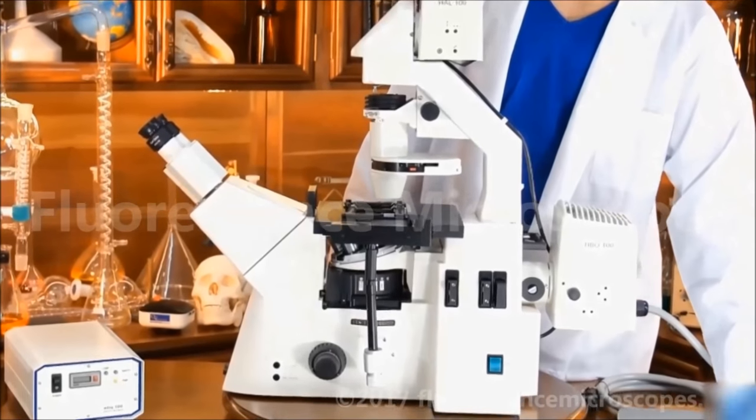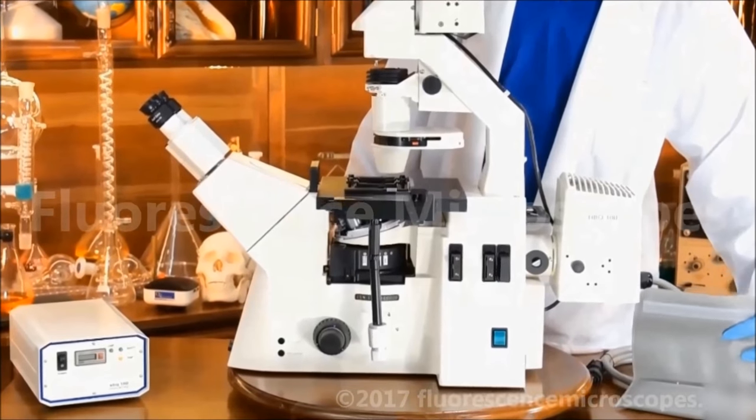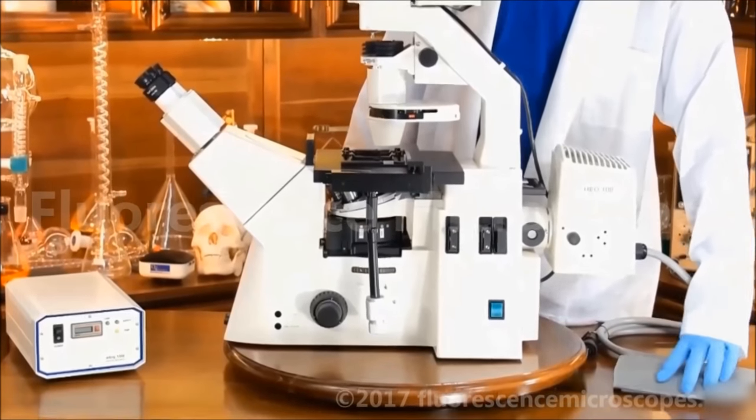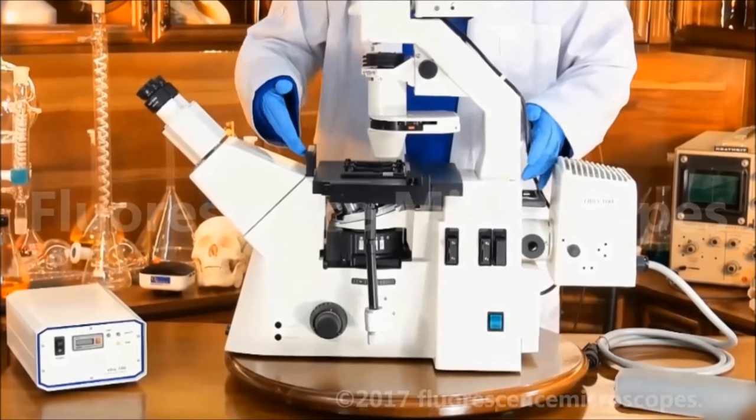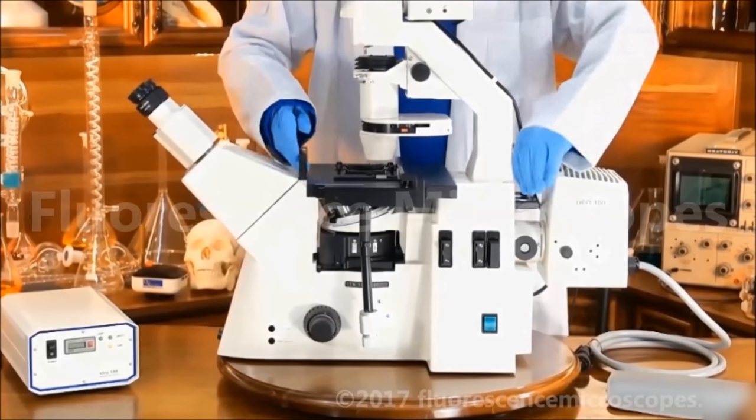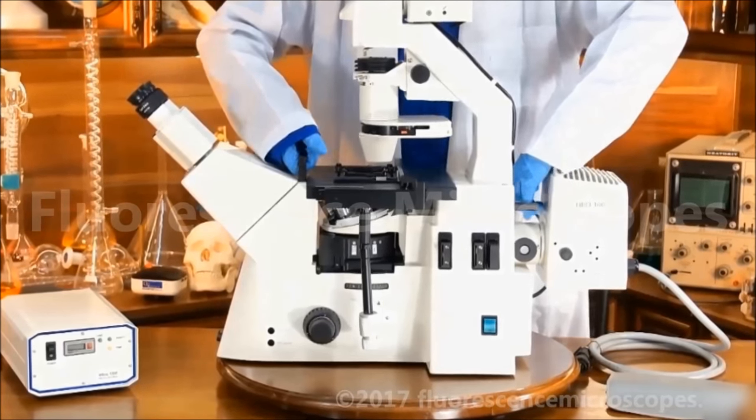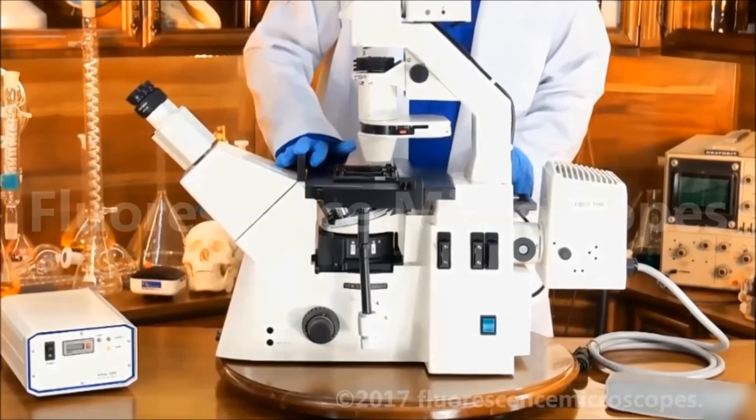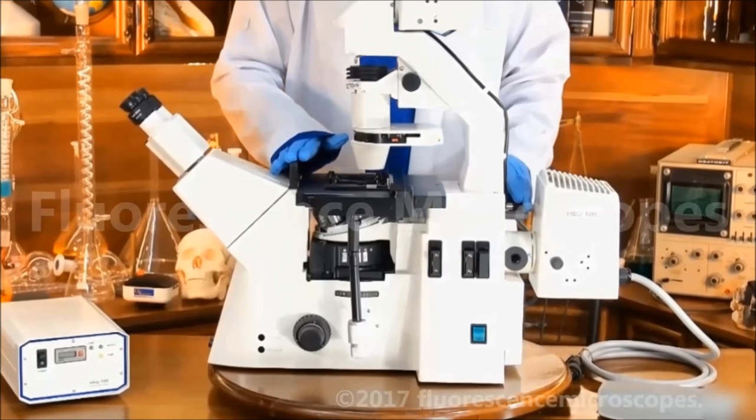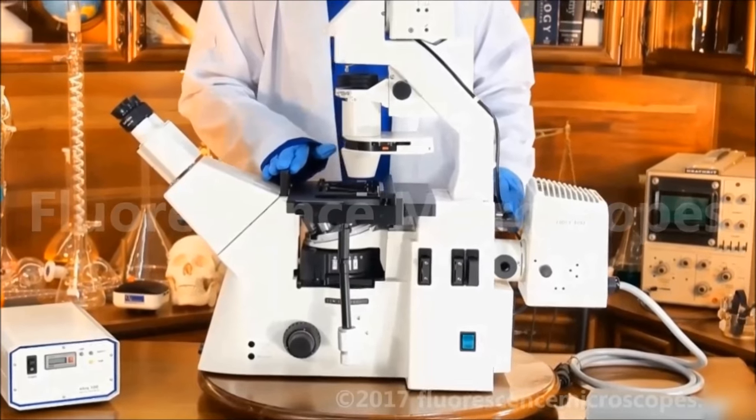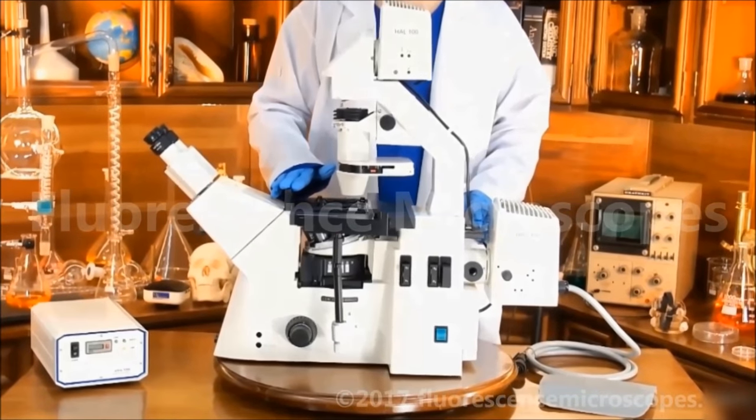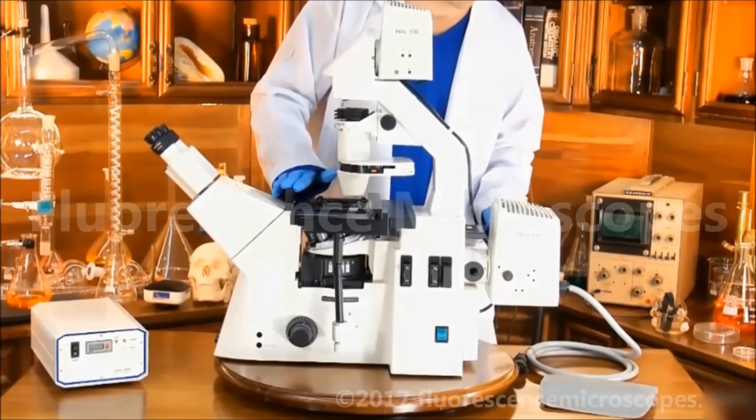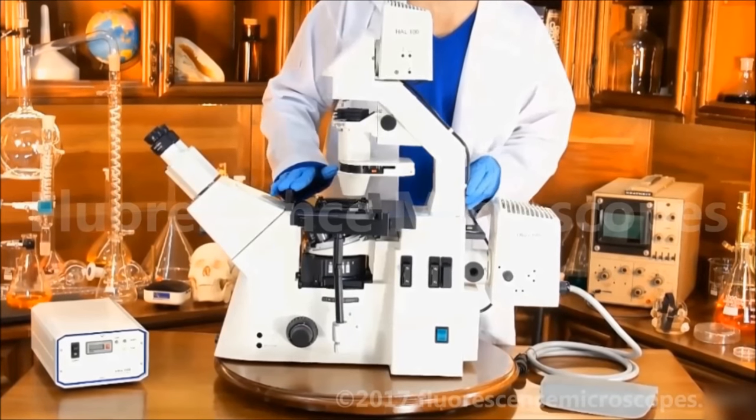We also include some tools, some Zeiss tool kit. That's the original. It comes with the microscope. This microscope has got a very convenient carrying handle on the front and the back. It's a very heavy unit. This is meant for research. This is not a clinical microscope by any means. This is an industry standard for fluorescence research. Research using fluorescence microscopy.